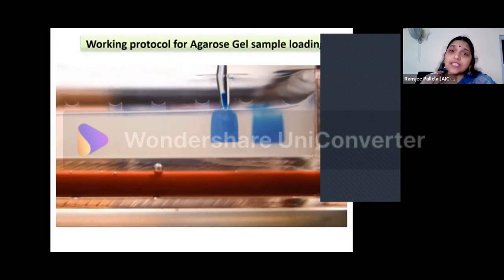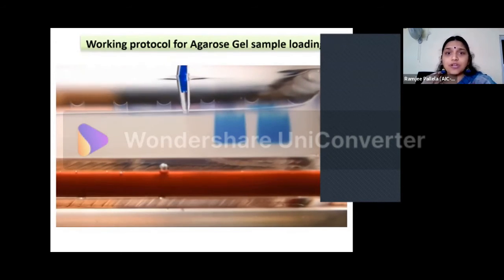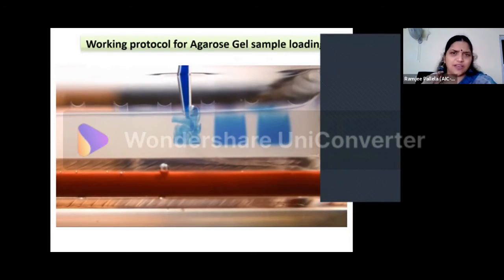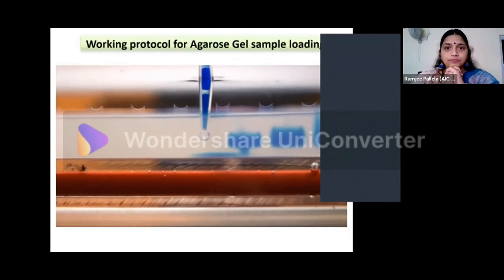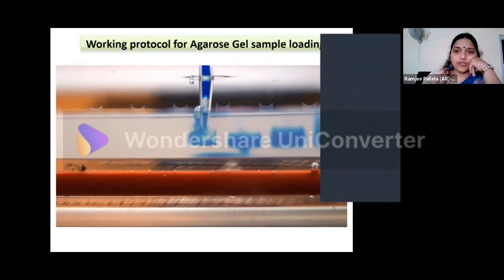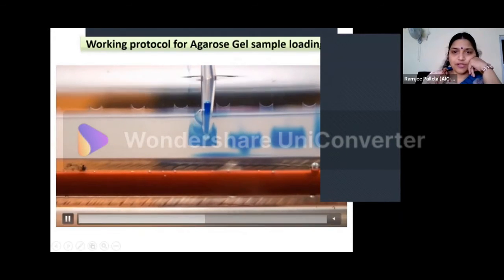In fact, agarose gel is much easier to handle than the polyacrylamide gel. So if you are using this particular gel, for regular PCR and checkup, it's fine. But for PAGE, it will be a little difficult or tricky to actually load your samples. Yesterday, Dr. Madhuri told you about that, right? So this is how you actually put your samples inside.